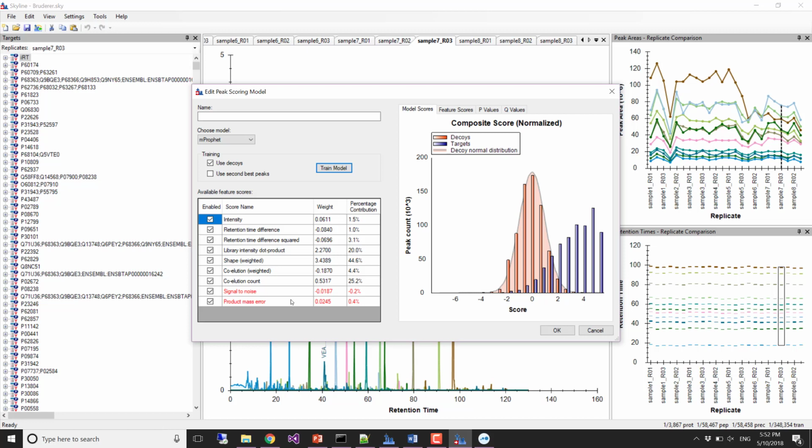So does everybody have that? Okay, so we'll go ahead and save that as Brooder hands on and click OK. Yeah.